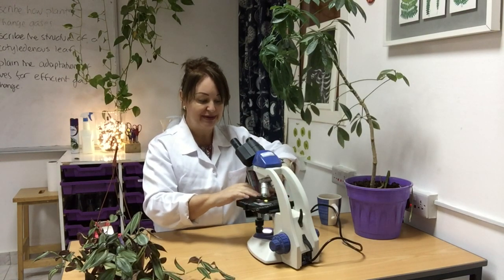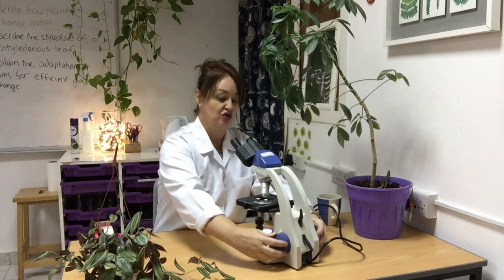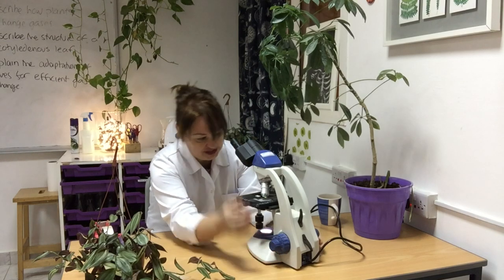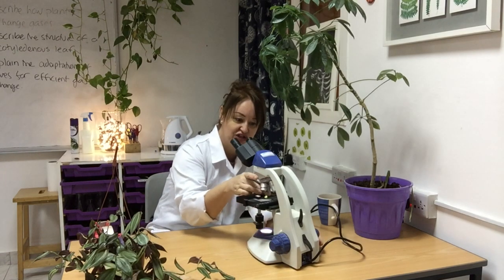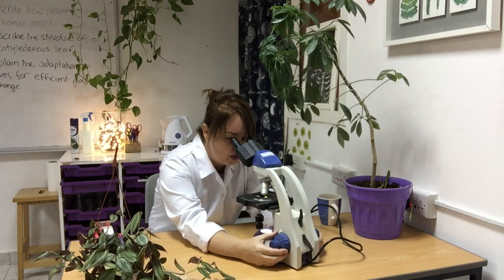You might want to clamp it down — remember you don't want a three-dimensional image, you want it as flat as possible. Wind it all the way up, look through your microscope, and wind it away. Best to start on the lowest magnification, wind it all the way up — what an image! Beautiful.